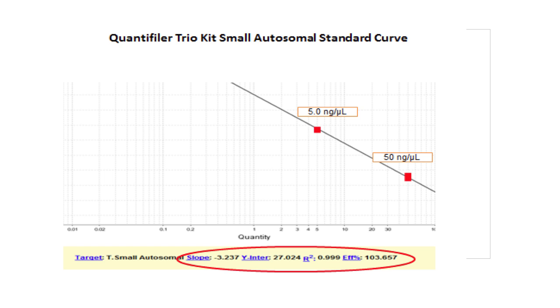Now, do you see the quality metrics at the bottom of the screen? Let's review slope, y-intercept, and r-squared.